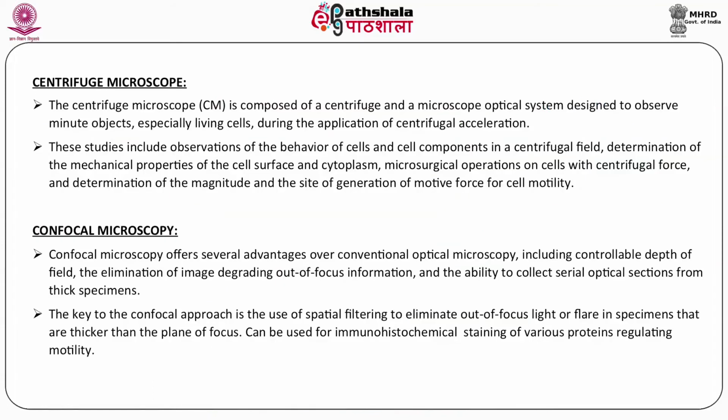Next is centrifuge microscopy, which is composed of a centrifuge and a microscope optical system designed to observe minute objects, specifically living cells, during the application of centrifugal acceleration.